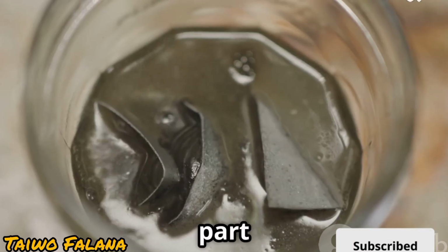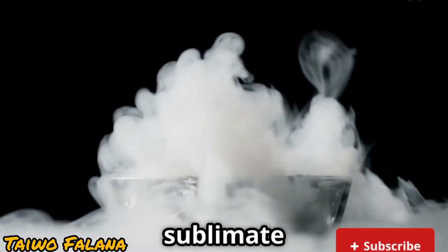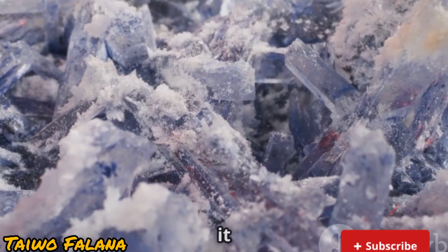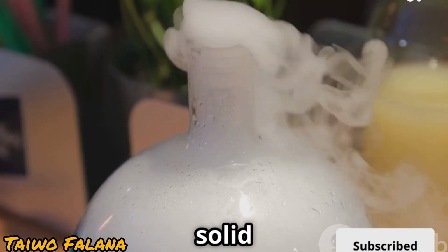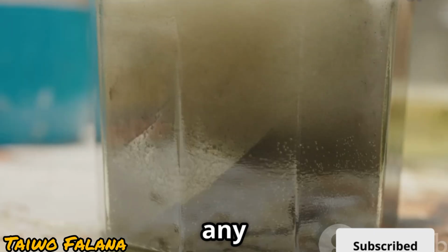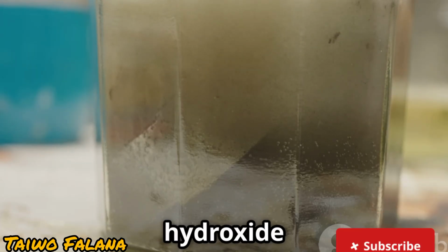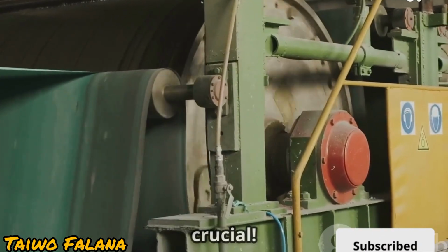Here's the fun part. As the HCl gas reacts with the foil, a white sublimate forms. That's aluminium chloride, and it's special because it sublimes, going straight from solid to gas and back to solid, without becoming a liquid. That's why you see it as a white solid on the foil. If there's any moisture around, aluminium chloride turns into aluminium hydroxide and hydrochloric acid. That's why drying the gas is crucial.